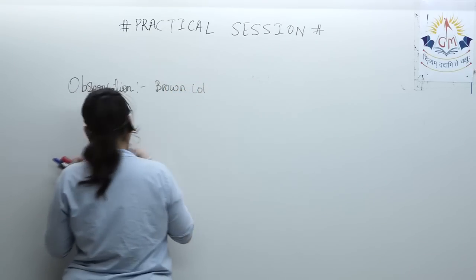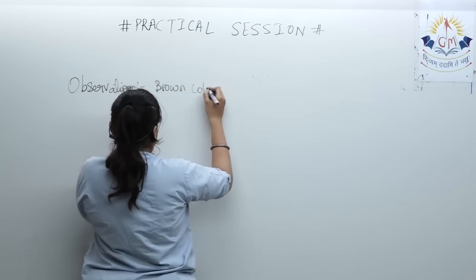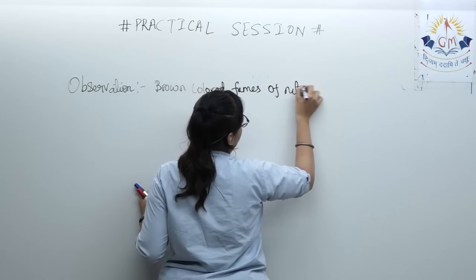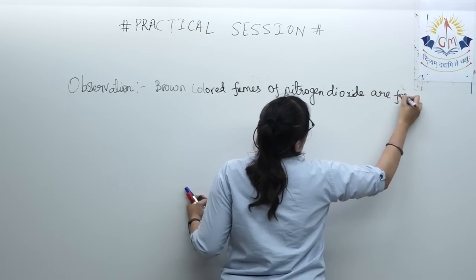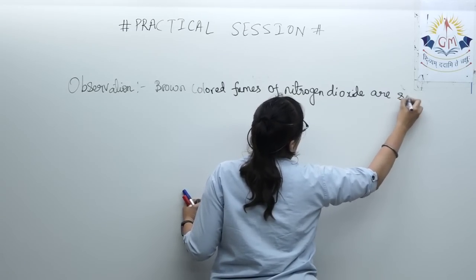Brown colored fumes of nitrogen dioxide are seen.